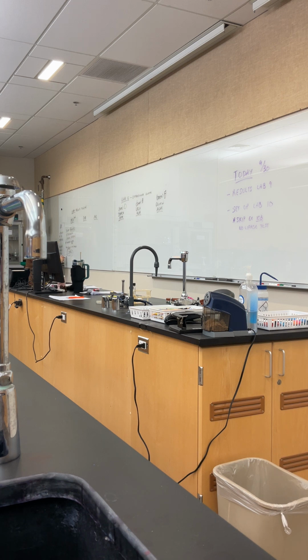We also have a component that makes it selective. So I mentioned last time there was something that made our media selective. I told you it was a really high amount of something, like 60 grams. Do you remember what it was? And it's in the name. Salt. Excellent. So what makes this media selective is a very, very high salt.